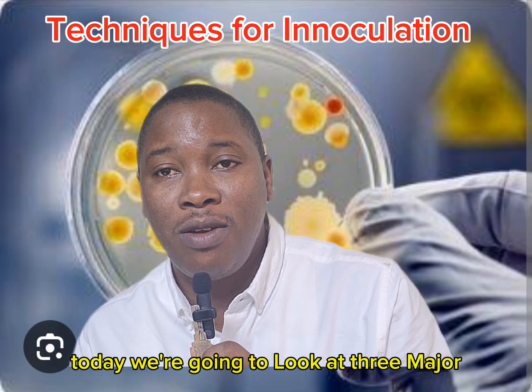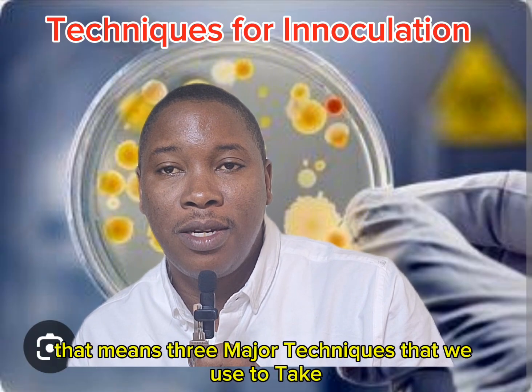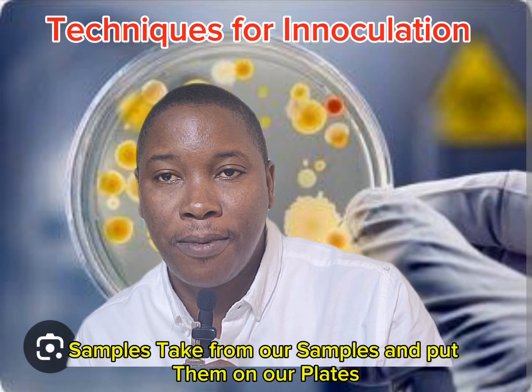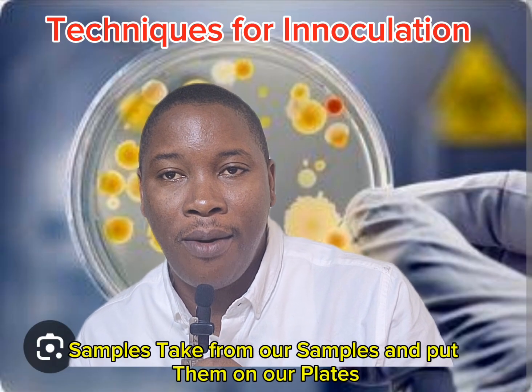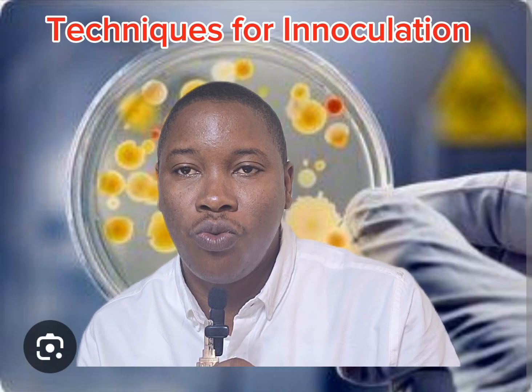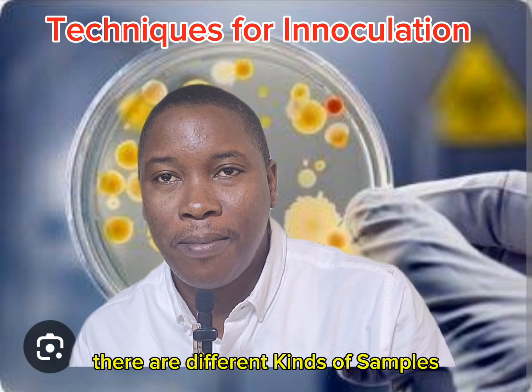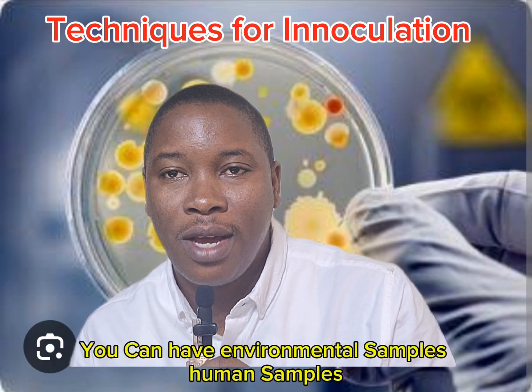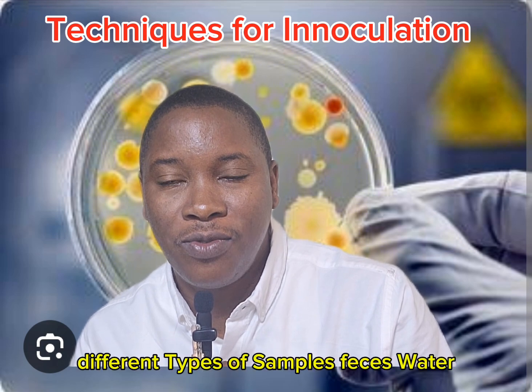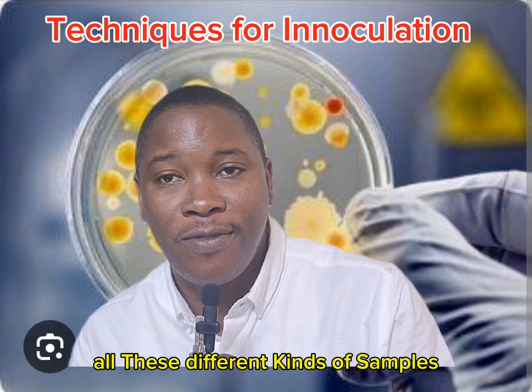Today we are going to look at three major techniques that we use to inoculate. That means three major techniques that we use to take from our samples and put them on our agar plates. Now, as a microbiologist, you want to culture out microorganisms from different samples. You can have clinical samples, environmental samples, human samples, different types of samples: feces, water, soil, insects, all these different kinds of samples.